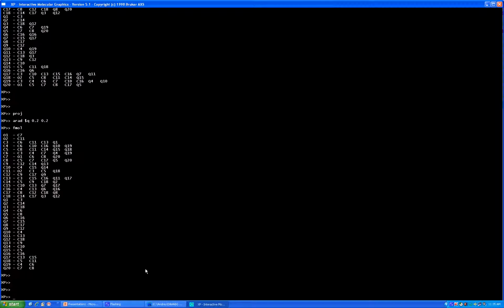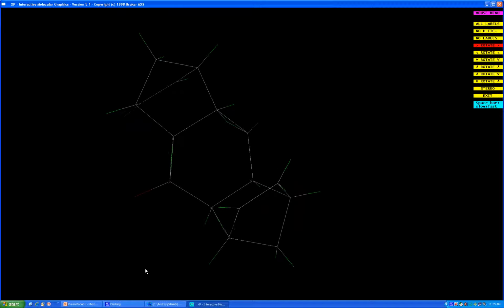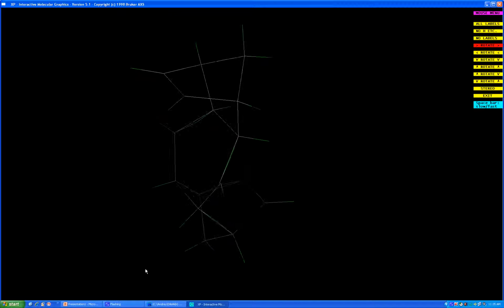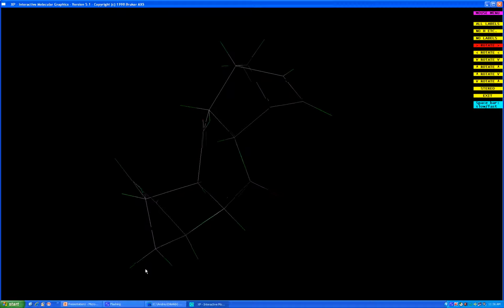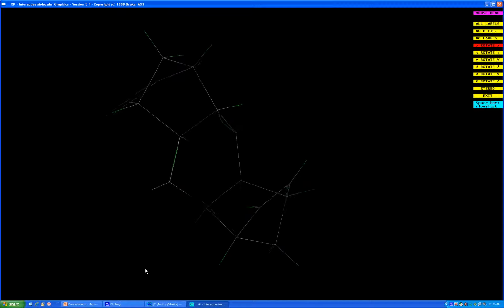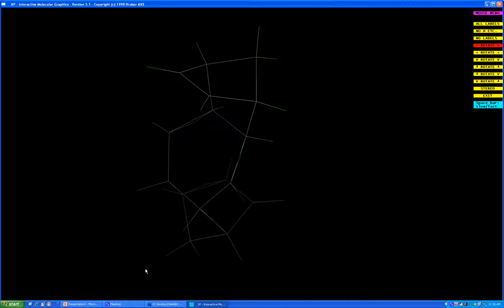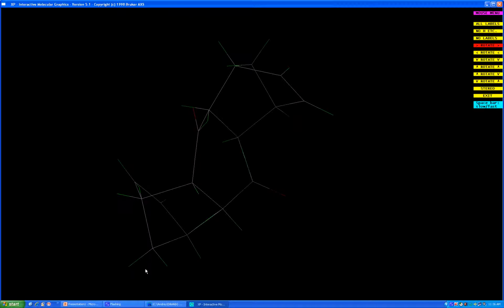So let me repeat fmol. If you do that right now, you can clearly see how the atoms are separated. So the Q peaks are all separated, but you still have several bad Q peaks which do not correspond to the hydrogens. So what can you do with them? Well, one of the things you can do is to get rid of them. How can you get rid of them? The same way we separate our good Q peaks from bad Q peaks.